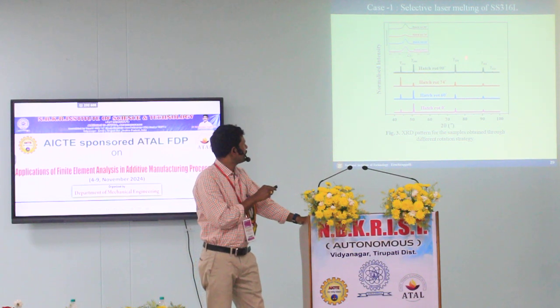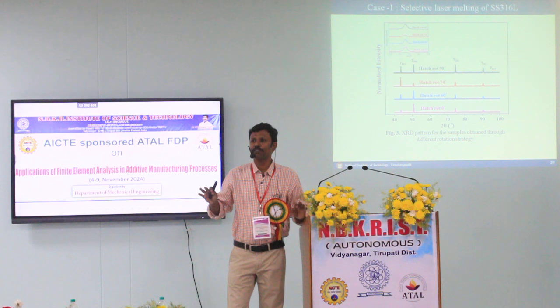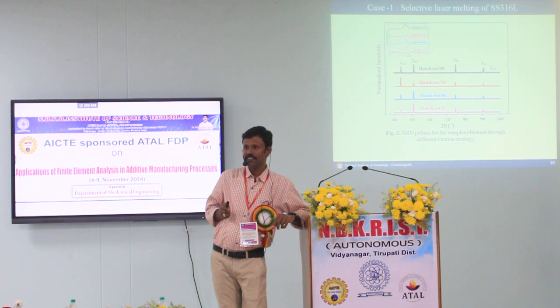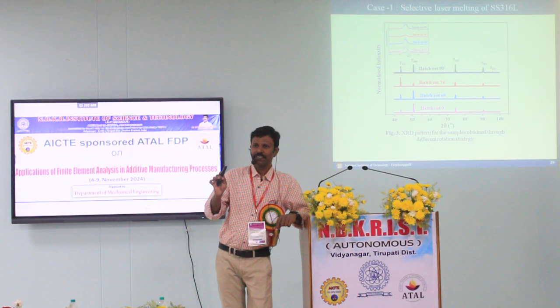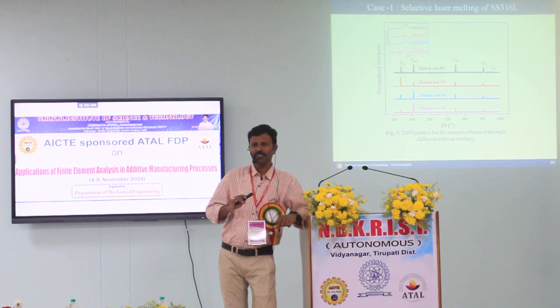Because every one peak corresponds to one plane. A set of 5-6 planes will give you what phase it is. That information is mostly enough for conventional XRD as a user, not as an XRD expert. As a user, yes, we can get it.